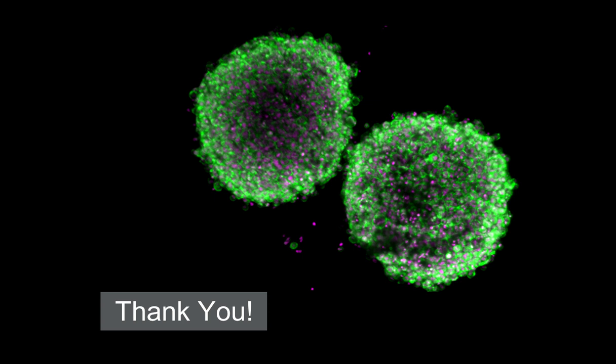And so if you're using a two-dimensional model of adherent cells, that's very easy because your cells are stuck to the bottom of your dish, and so you can be fairly vigorous with your washing and changing of fluids. With these spheroids, they're all just gently sitting in the bottom of this dish.